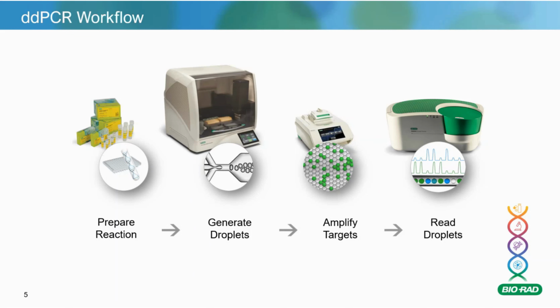You've also got your supermix, which is specific to digital PCR. Why is it specific to digital PCR? Because the viscosity is just slightly different, because obviously you're dividing everything into a lot of droplets. So if it doesn't occur in the droplet, no reaction will occur. Your supermix is obviously composed of dNTPs and buffers and coenzymes, all that stuff that's normally contained in a supermix. And that's it. There's nothing else that goes in there.